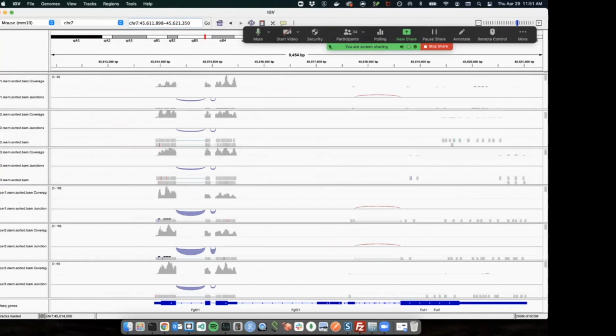So the last three are all RSEM. By the way, I just loaded the RSEM results, and the last three is experiment data, and the first three is the control data. As you can see, the heights are quite different, so you can see the scales over there.